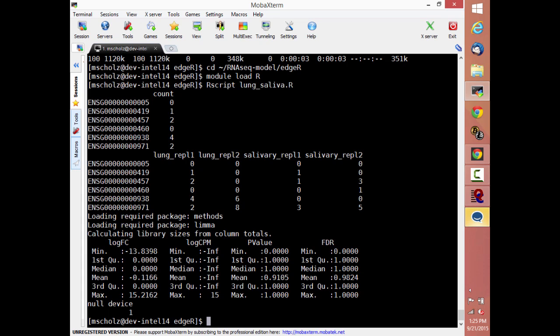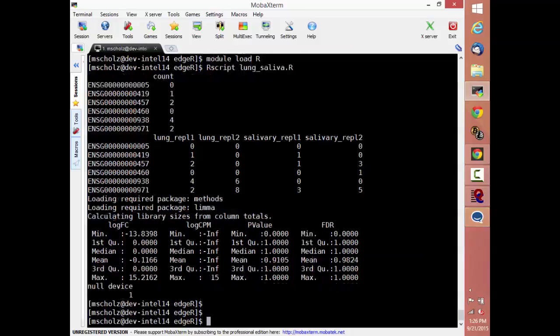You can see it took one condition of your data here, your lung replicate 1. And it made a table where it has every gene and then every condition next to it, or every condition as a column in that gene. So it's essentially making a table. Does that make sense? You can't do comparisons between things without putting them into a table, at least in stats you can't.